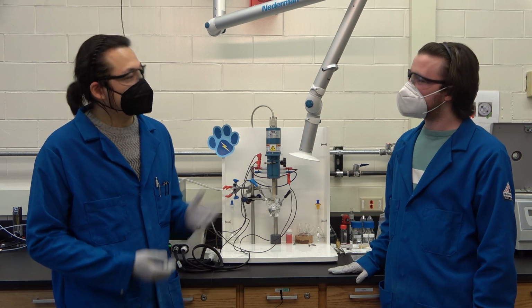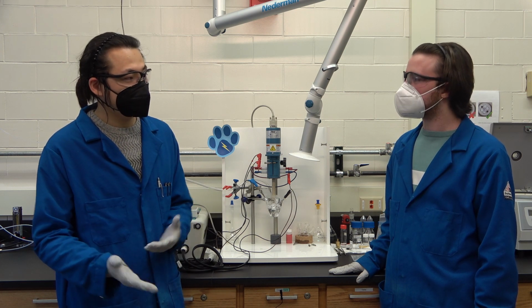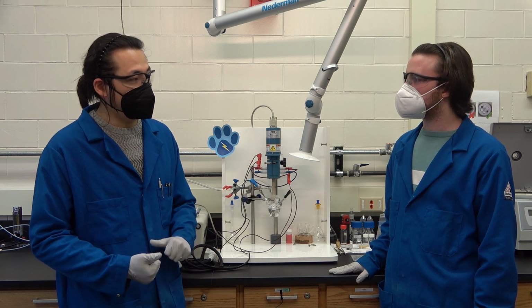Awesome. And what do you do with your nanoparticles once they're synthesized? That's a very good question. I use the particles to electrochemically oxidize the hydrocarbons into CO2 in order to extract energy out from them.